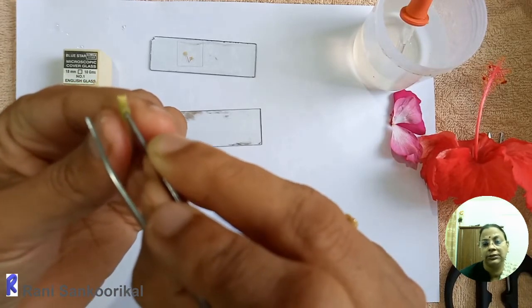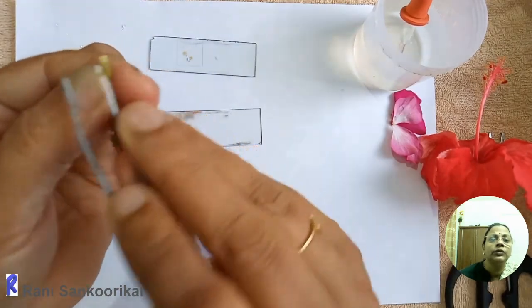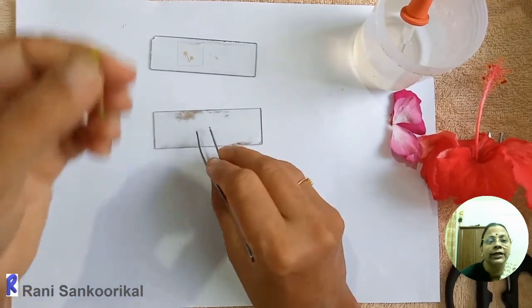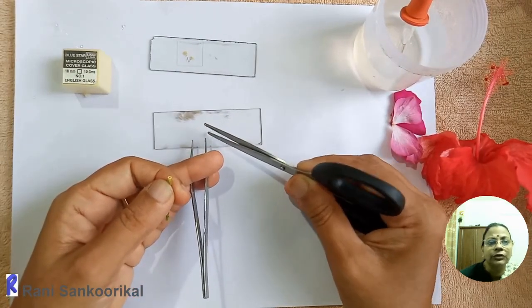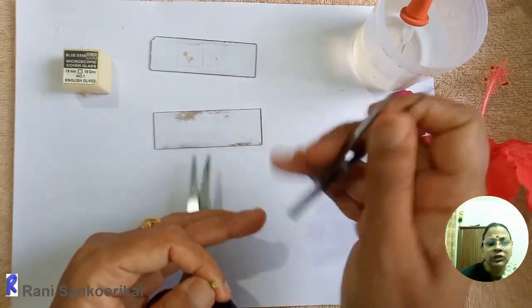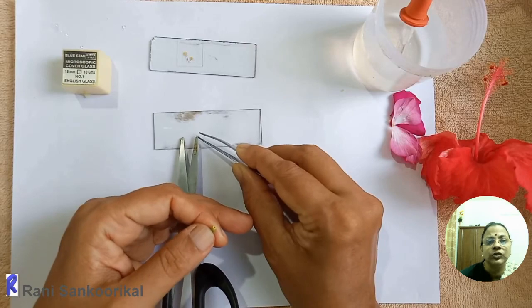With the help of plucker you can slit open the corolla tube and take the stamen. It is very minute, 4 stamens will be there. From that, with the help of needle, you can separate it. So it is very minute only. With the help of that, you can remove it and place it on the slide.